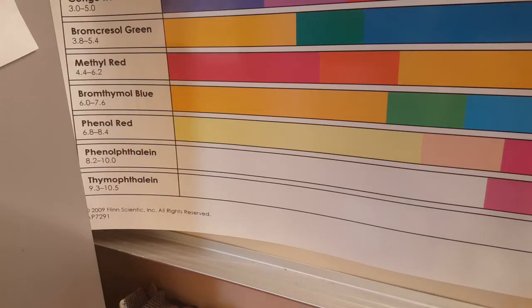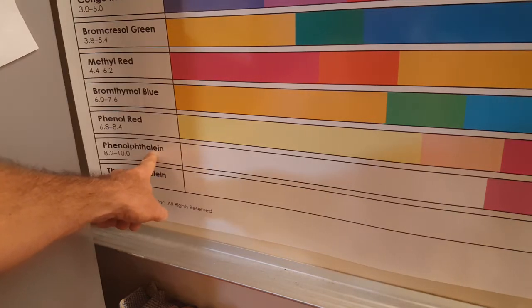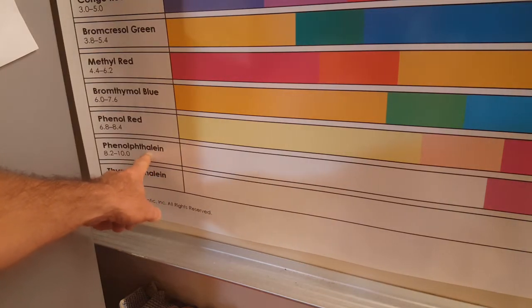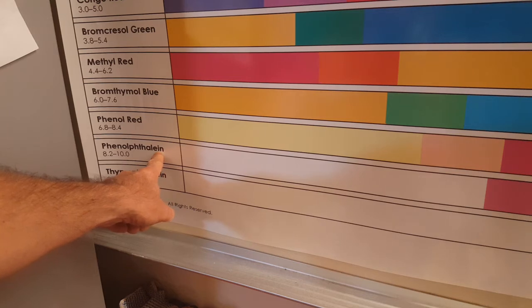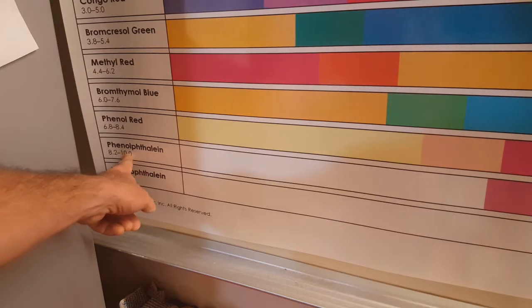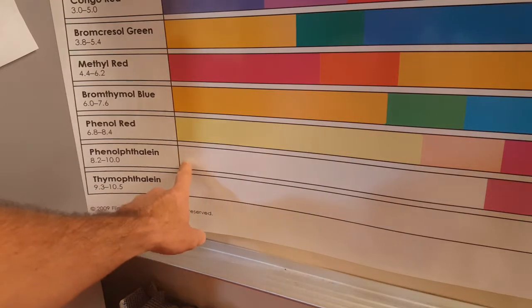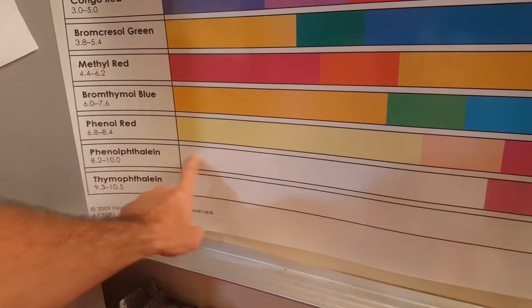This is my Flynn pH indicator chart. So we're using phenolphthalein today, and you can see that phenolphthalein will start to turn a color between the pH of 8.2 and 10.0. Now we put the pH indicator in with the acid. So when it starts with the acid, it's at a very low pH.